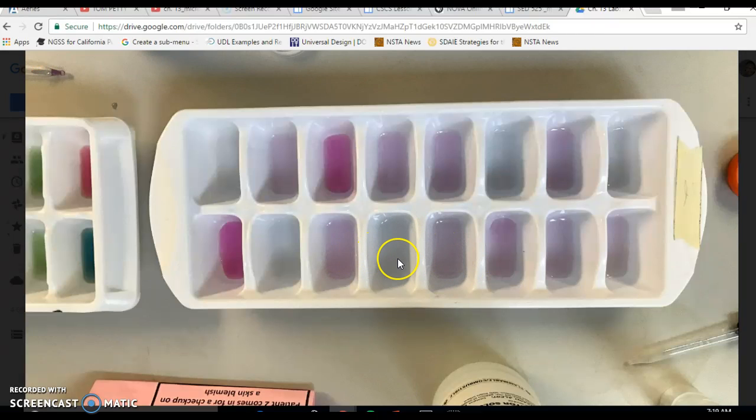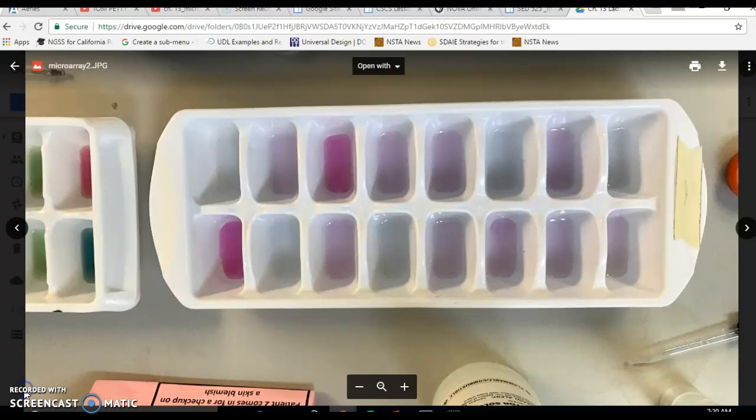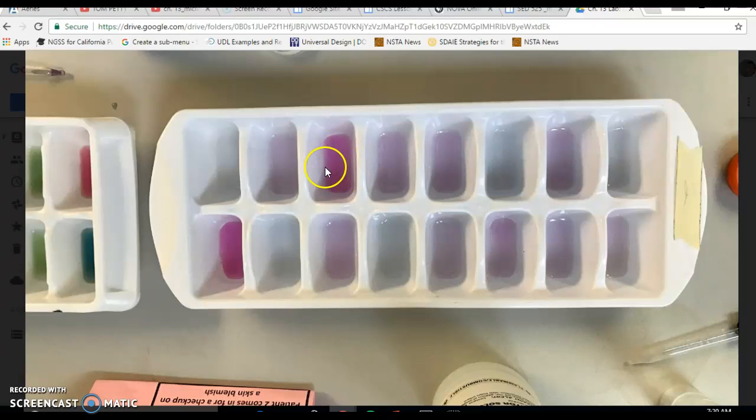So you really have to be a very careful observer to identify which genes are silenced or inactive, like this, versus normal functioning, like this. And it's common for high school students or even college students doing this microarray lab to misidentify which genes are active or inactive. Identifying whether a gene is highly active, making large amounts of protein, the darker pink, is somewhat easy, but the difference between the silenced or inactive genes versus the normal functioning genes is rather close.